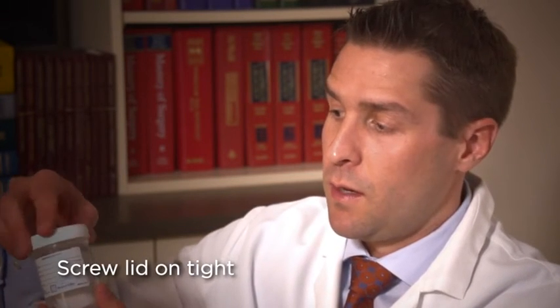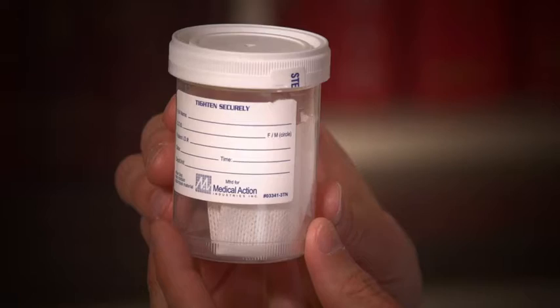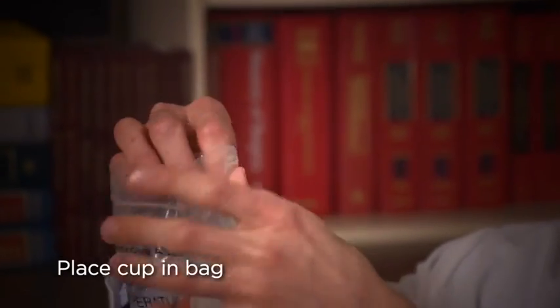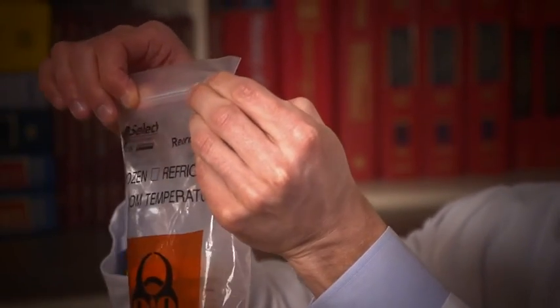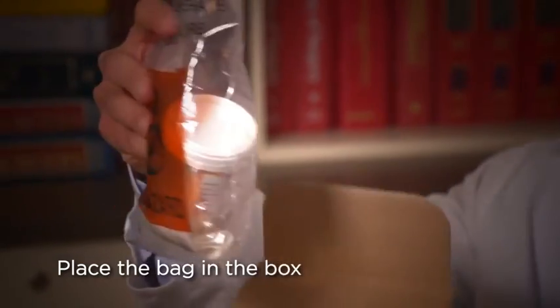When using this small collection cup, make sure that the lid is screwed on tightly, as we do not want the urine to leak during the shipping process. Once you've made sure that the cap is screwed on tightly and that the appropriate labeling information, including your name, date of birth, collection time, and volume, is placed on the cup, place the cup into the bag and place the bag inside of the box.